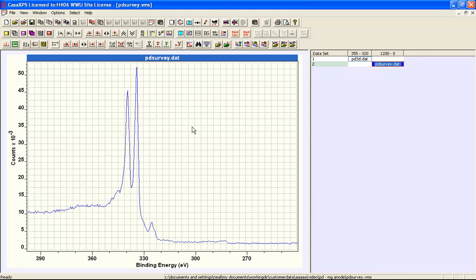And the context for the data is important. For example, these data were measured using a magnesium anode and as a consequence we have a primary photoemission line.